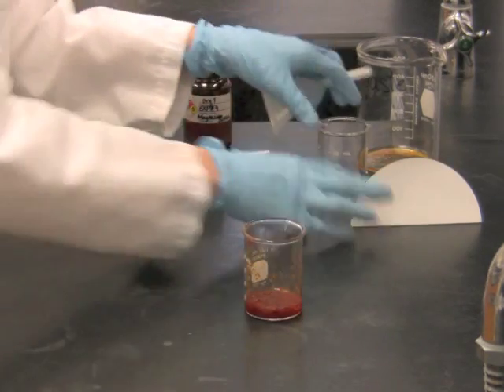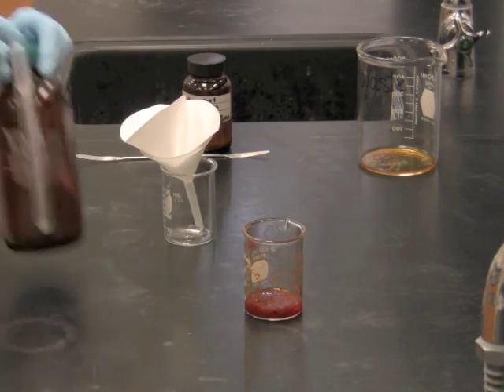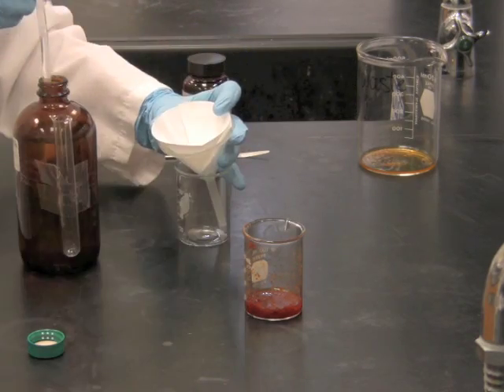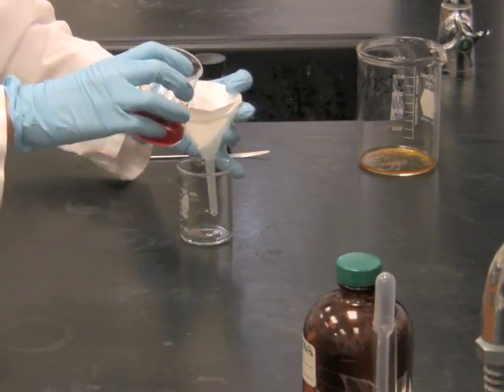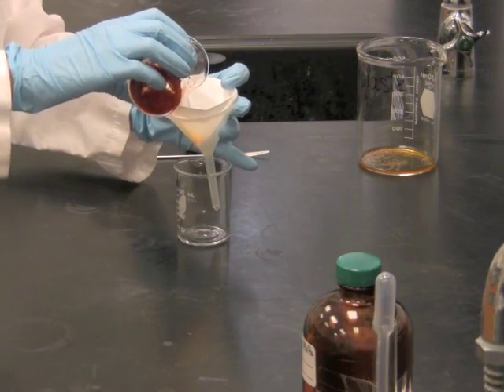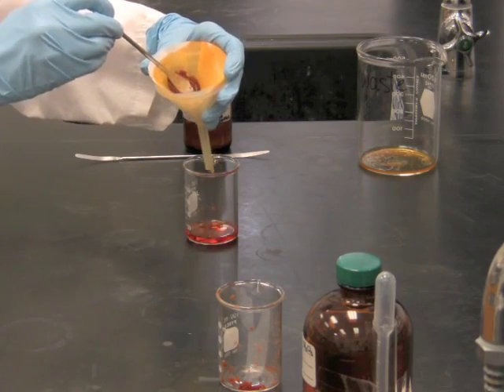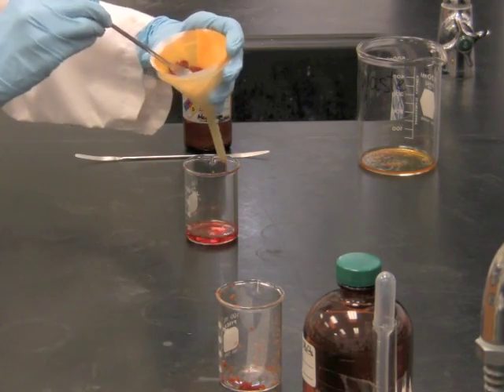Next, we're going to filter this solution into a clean, small beaker. I'm going to wet the filter paper with a little bit of the solvent. I'm just squeezing the tomato paste a little bit to get any extra liquid to come out and go through the filter paper.